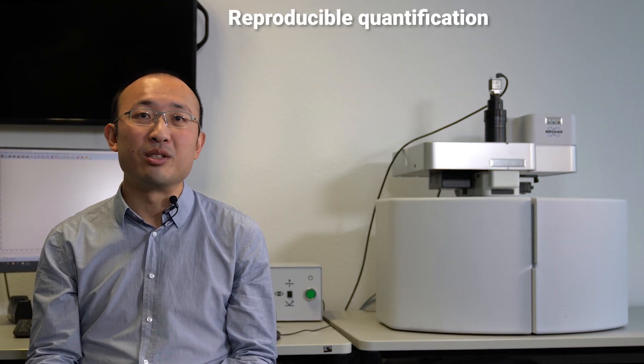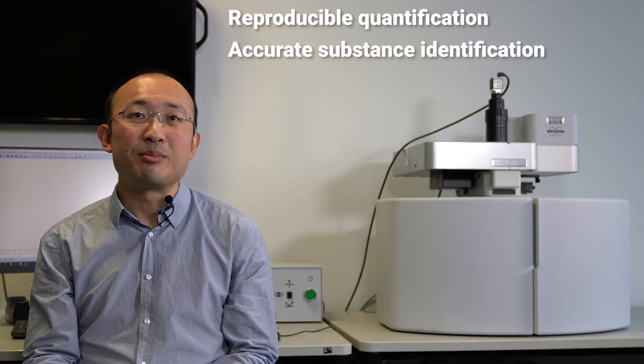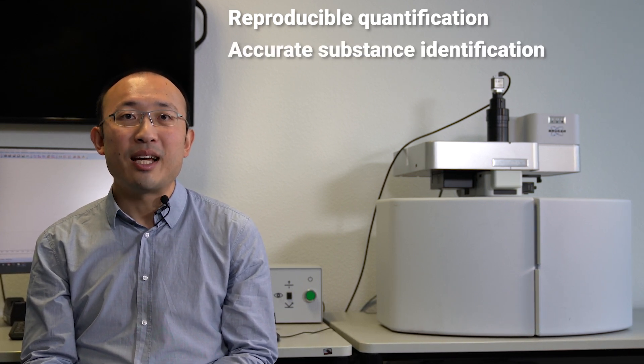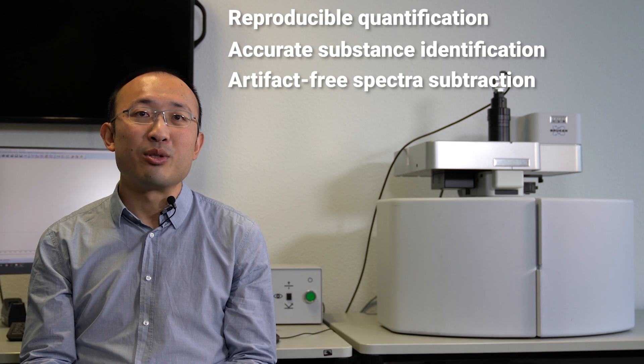And it also guarantees reproducible quantification results, more accurate substance identification, and artifact-free spectral subtraction.